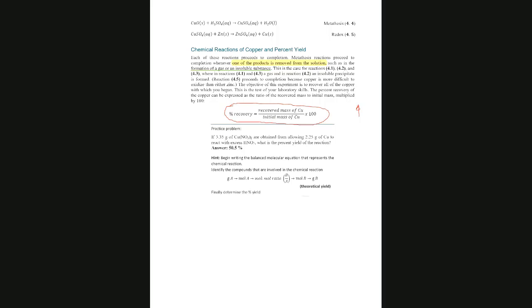and that's why the percent recovery is high. But there is another possibility: when we work in the lab, we are a little sloppy, or there is a reaction, or we didn't see and we lost some solution, we lost mass. It's normal. When I make a cake, I cannot recover everything.